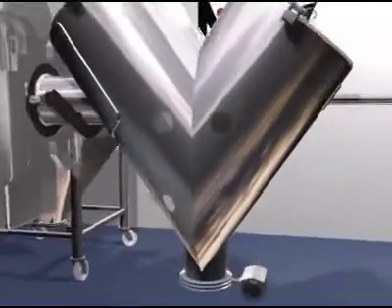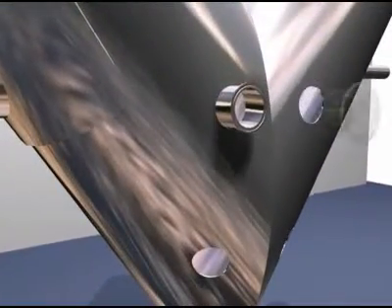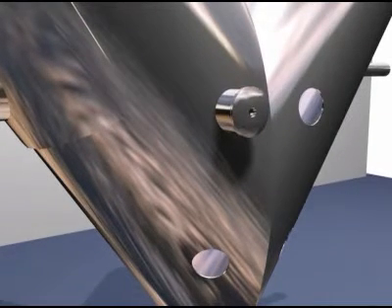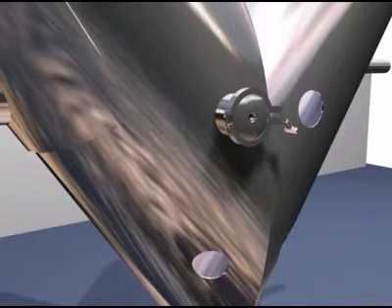This animation illustrates the use of sensors on a V-Blender, but any existing blending equipment, including double-cone blenders and bin-base systems, can be retrofitted with standard 2.5-inch tri-clamp fittings.